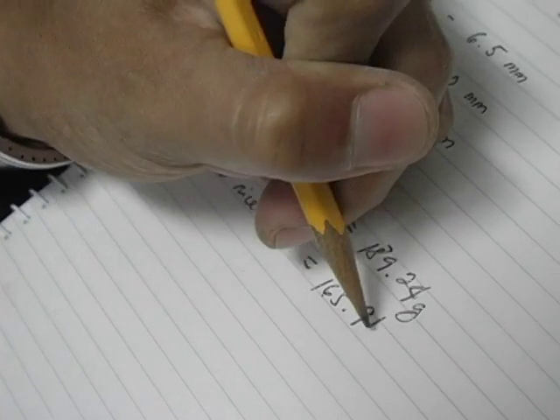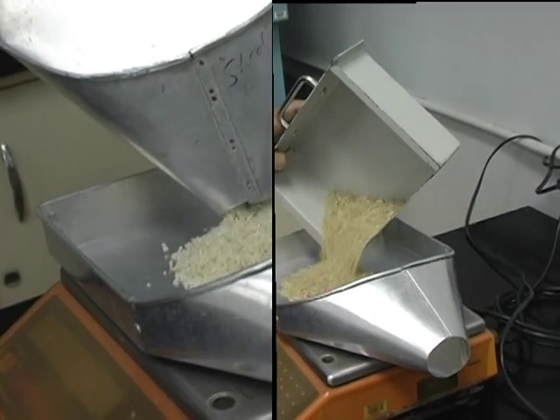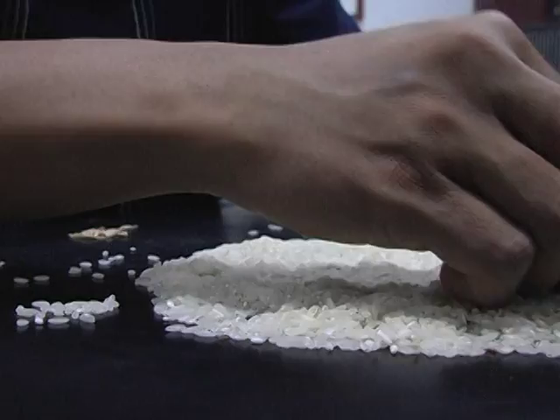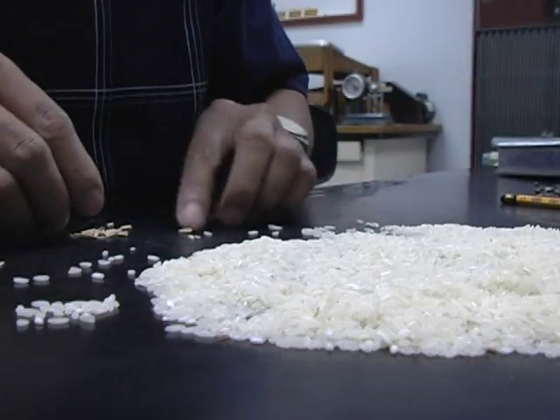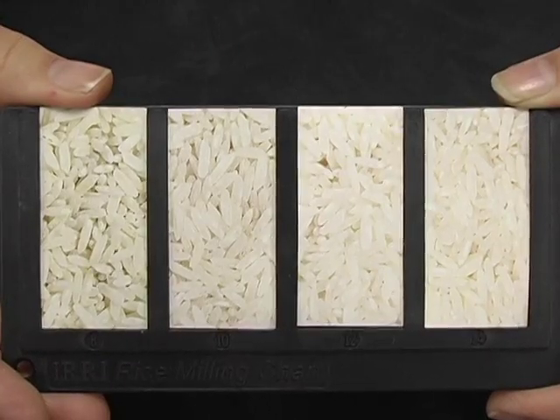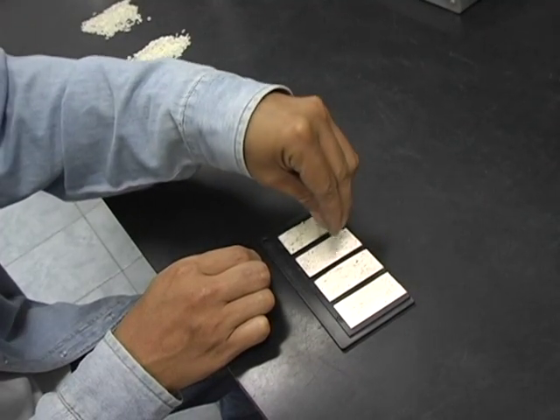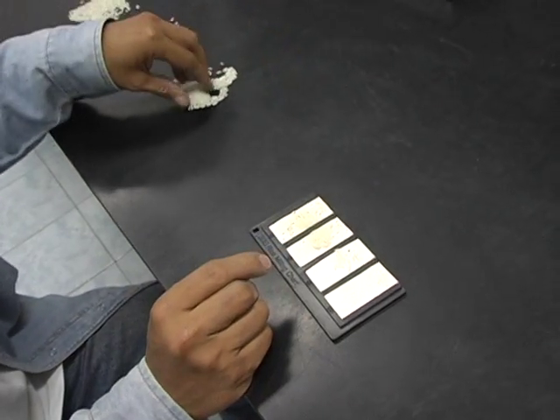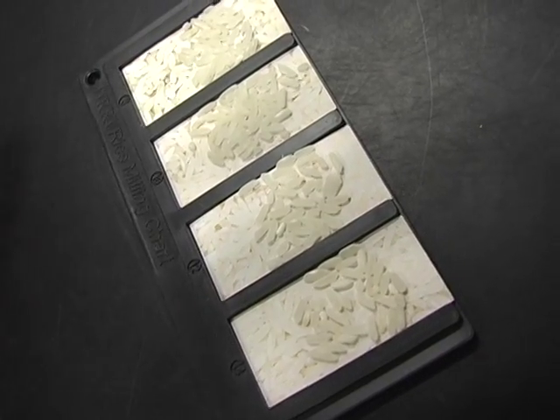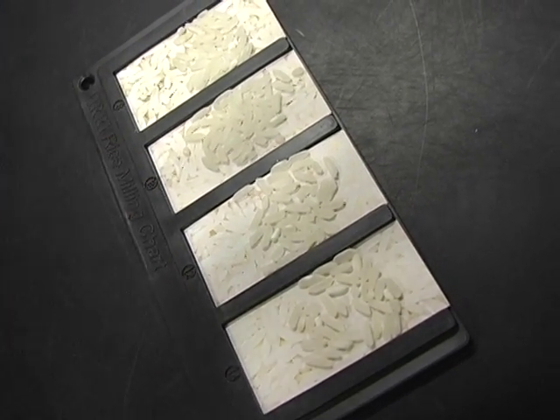Calculating the milling degree is not always possible because it requires weighing the brown rice and the milled rice. If only a milled rice sample is available for a quick estimate of the milling degree, the rice milling chart can be used. Put a small sample on one of the 4 panels of the rice milling chart. Read the milling degree of the background panel, which matches the grain sample best.